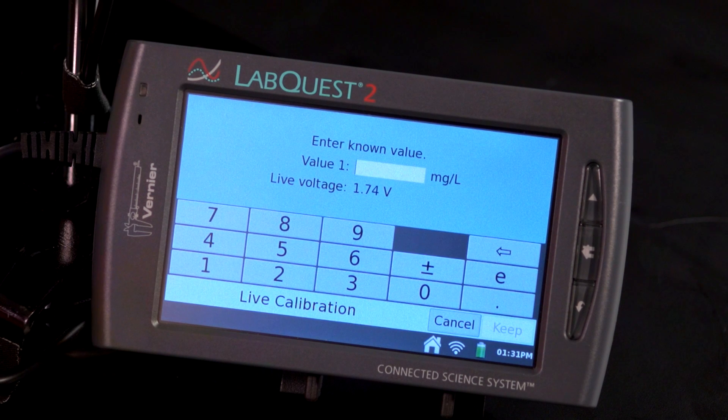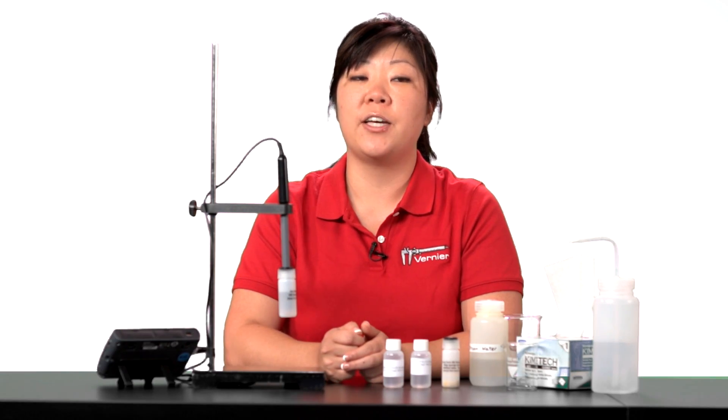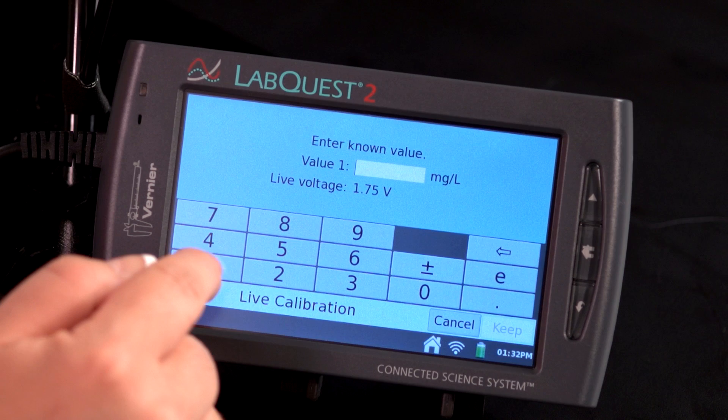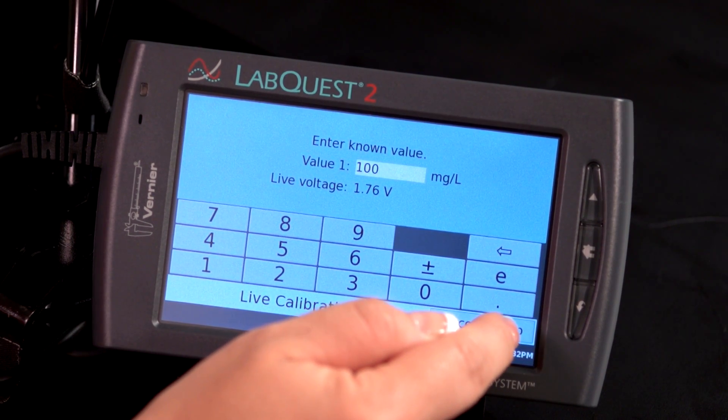Your sensor will have been in the high standard for at least 30 minutes. Enter the high standard value into the Value 1 box. For the nitrate ISE, this value is 100 milligrams per liter. Then tap on Keep.